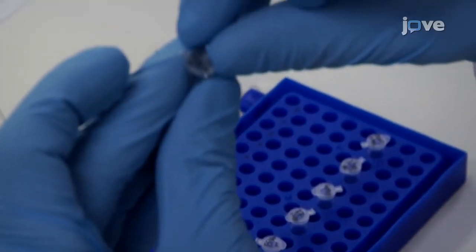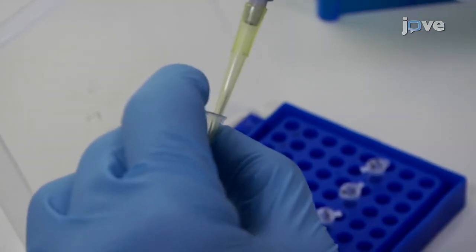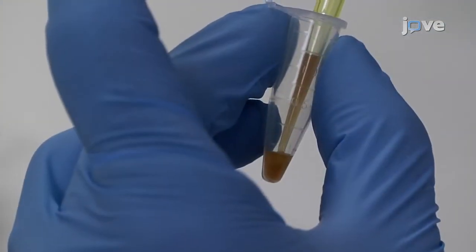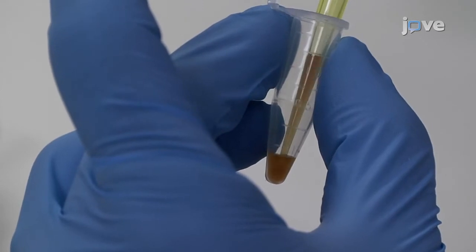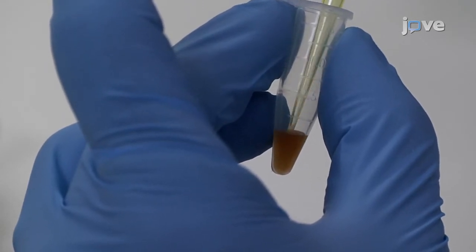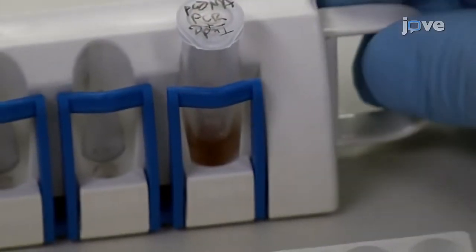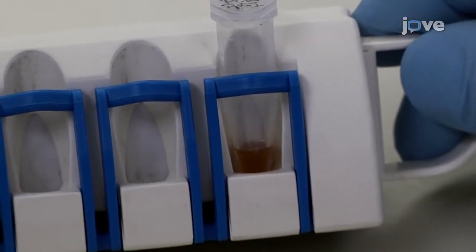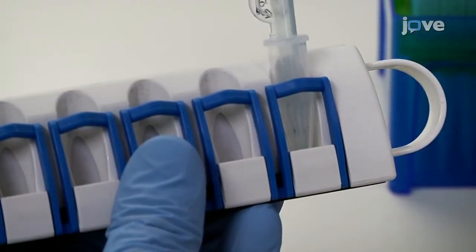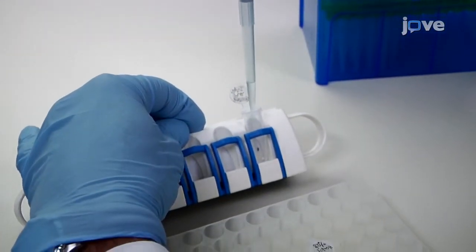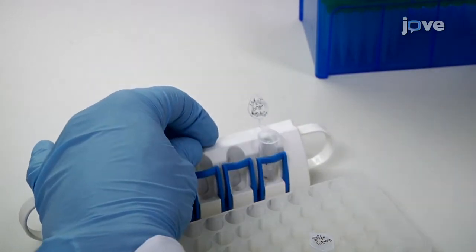Transfer the PCRs pre-digested with DPN1 to 1.5 milliliter tubes and add 81 microliters of DNA purification magnetic beads to each tube. Incubate the mixture at room temperature for 10 minutes. Place the tubes on the magnetic collector for 2 minutes. Now, discard the clear liquid. Wash twice with 200 microliters of 80% ethanol for 30 seconds.